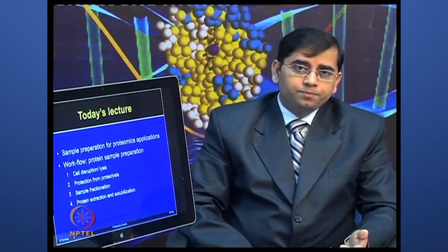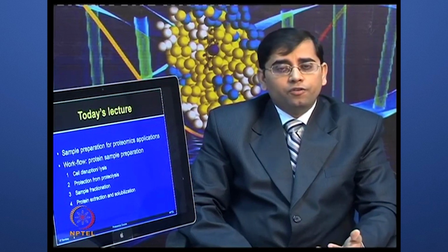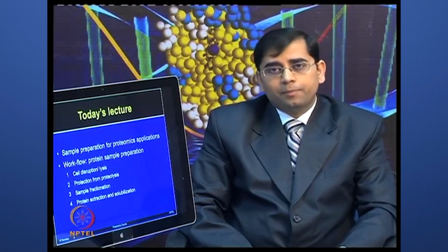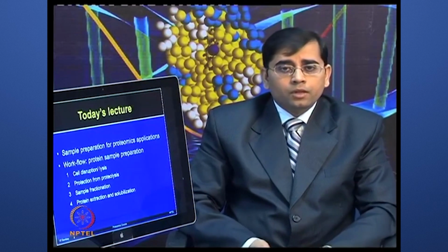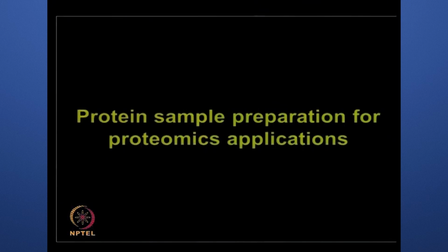So, during this lecture, I will talk to you about different types of components which are essential to make a good sample preparation for proteomic applications. I will give you a stepwise workflow. So, let us start. Workflow for proteomic sample preparation.